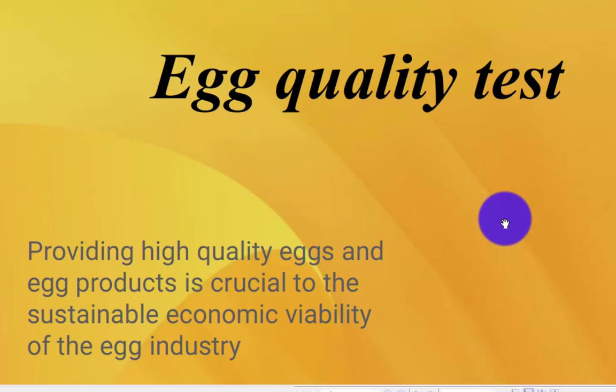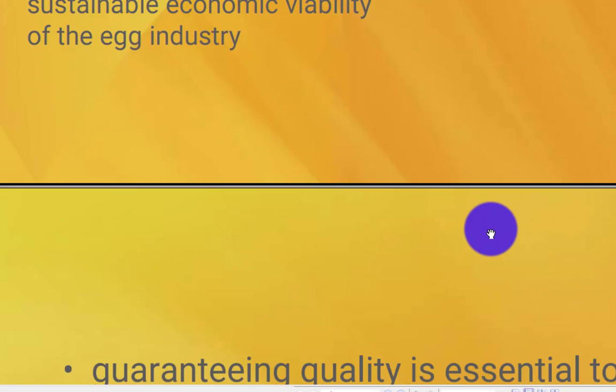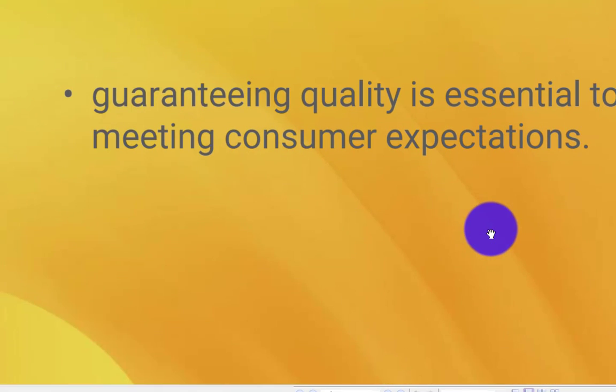Egg quality test. Providing high quality eggs and egg products is crucial to the sustainable economic viability of the egg industry. Guaranteeing quality is essential to meeting consumer expectations.